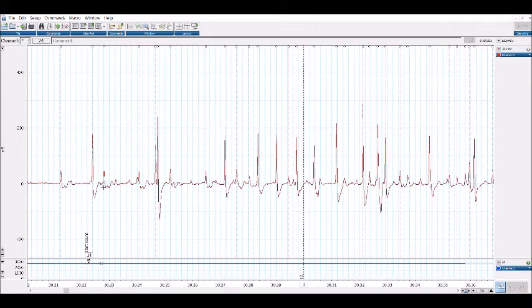So you start here, and let's see, we want that one, so hit a 1. We want this, but it didn't count it. We want this one, didn't count it. This one, this one, this one. This one right here is kind of tiny, but we want that one. This one. This one's good. And you're just hitting a 1 for all of these. 1 here, 1, 1, 1, 1 here.